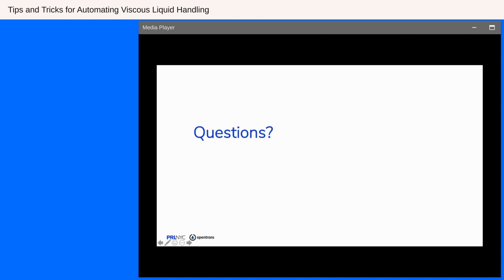So definitely the tip material, the tip shape or the tip brand has an effect on the liquid handling performance. It's a good idea to try out the tips, test out the volumes of the liquids using your gravimetric methods, and then only rely on those tips which you think are going to perform well with your liquid handler. Great, thank you.